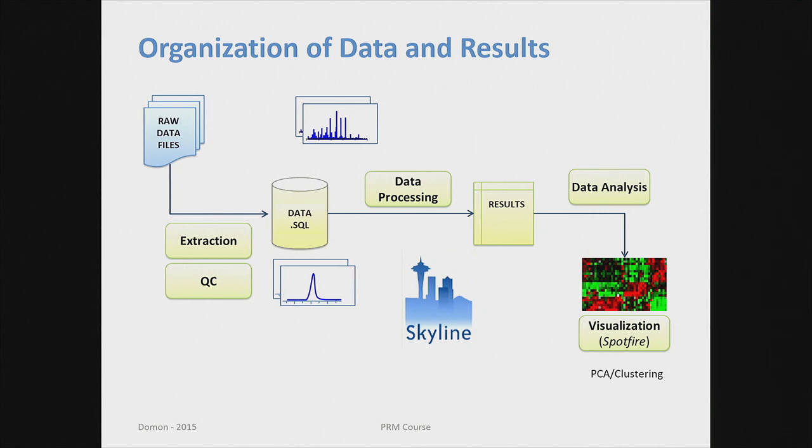So we now try to design a process. We do multiple experiments. We basically have all the raw files. We try to work out a script via Skyline, or first independently and then going to Skyline. Basically, you get two types of objects in this data. First, you get the full MS spectra, which have their utility, and I already discussed that. So the MS spectra are actually a very useful set of parameters we have. And then you extract the traces of interest, you process them, quantify within Skyline, and eventually you have your result.